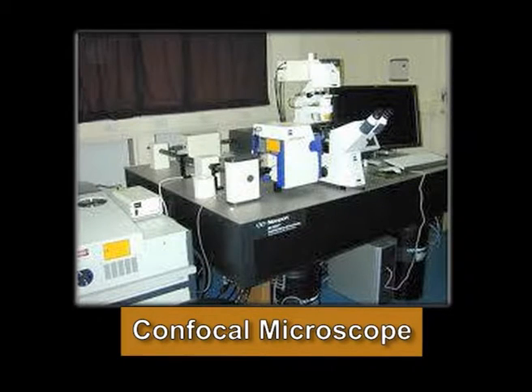Okay. Now, another important implication of the confocal microscope is that because of the arrangement of the filters and the pinholes, and because of the use of lasers, we can use more than one fluorophore and image them in one go. However, there's a major problem, that is the problem of bleed-through. So what is bleed-through?